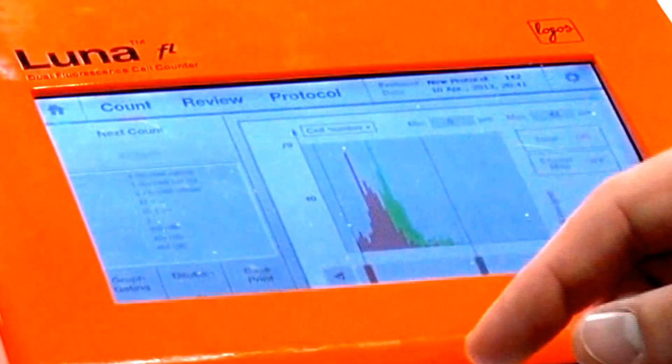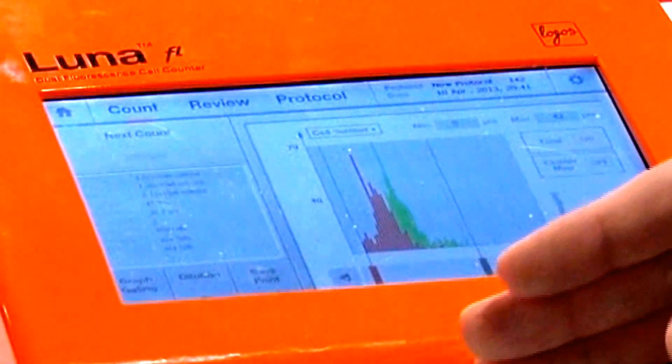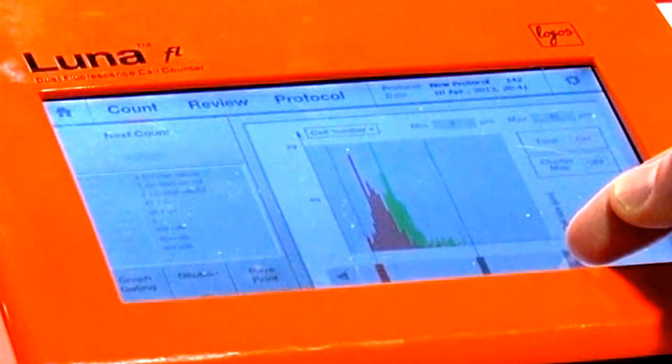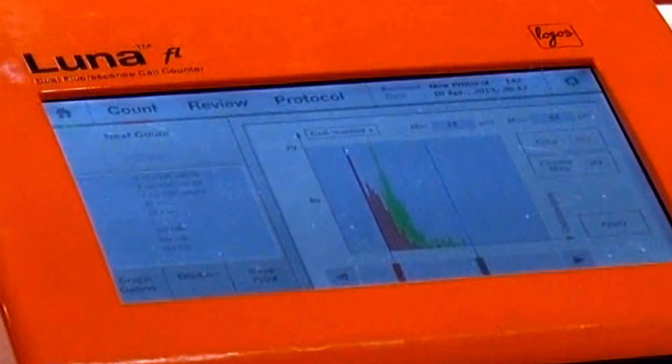For further analysis, you simply hit the graph and it will display your data in a convenient histogram. You can furthermore analyze the data by toggling the gating function to hone in on a very specific region of your cells.